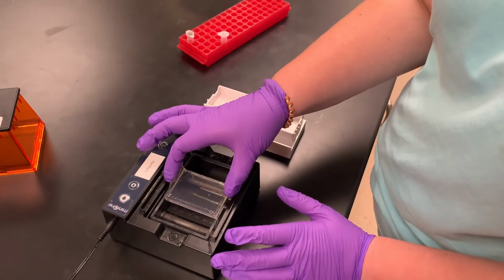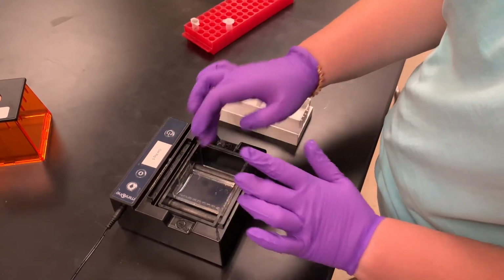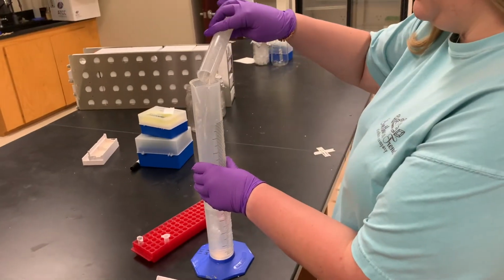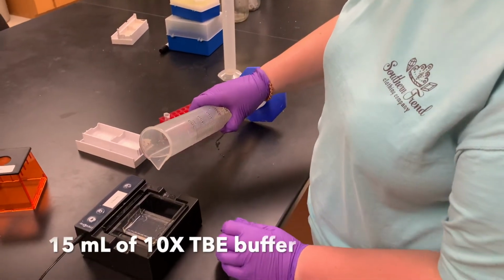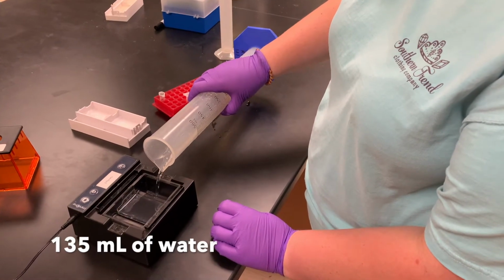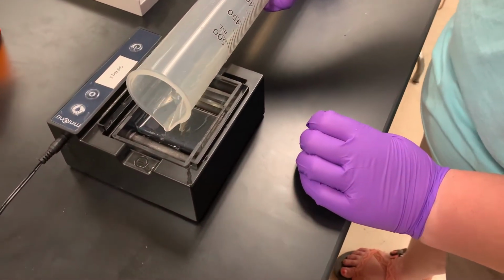Place the gel in the gel rig, making sure to align the wells with the well marks in the rig. Make 150 milliliters of 1x TBE running buffer. To do this, combine 15 milliliters of 10x TBE buffer to 135 milliliters of water. Pour the buffer into the gel rig, making sure it covers the surface of the gel.